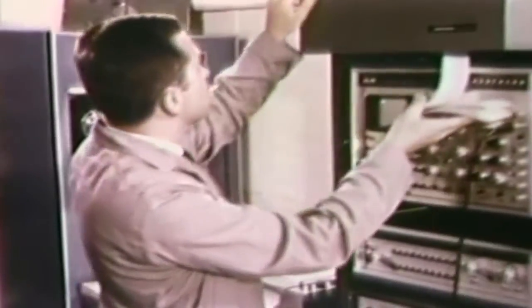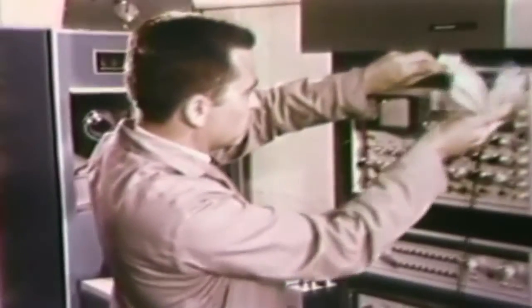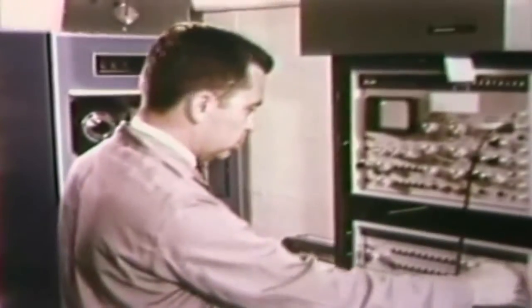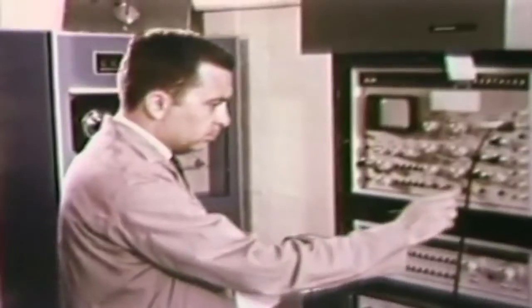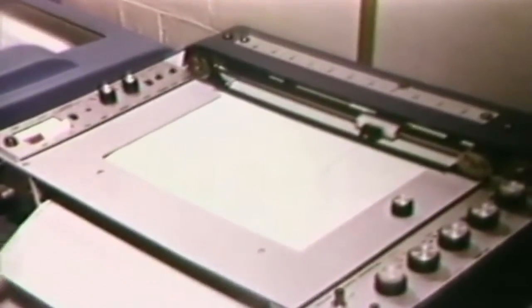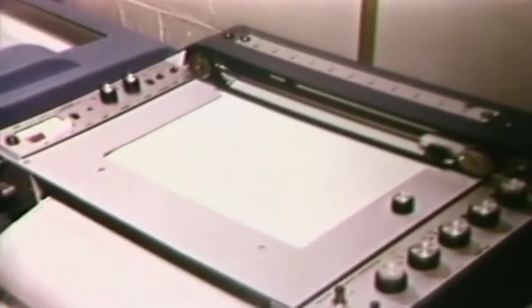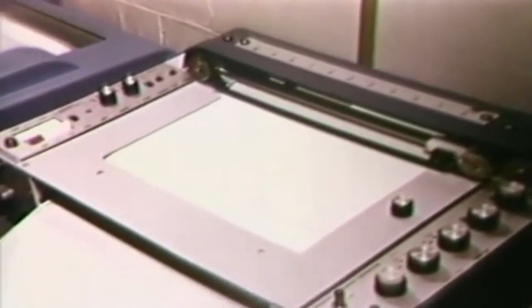The arsenic content of the bone sample submitted was significantly higher than that of normal human bone. This finding, of course, is of prime importance in a suspected arsenic poisoning. The analyzer also produces a permanent record in chart form. The analysis was quickly and conveniently accomplished in the FBI laboratory, employing the great sensitivity of neutron activation analysis for the detection of arsenic.